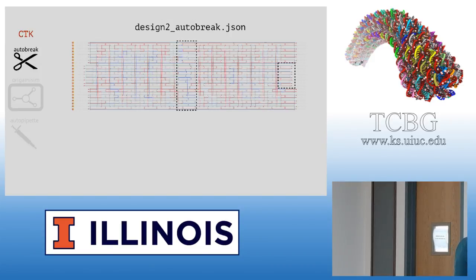But then, what you can do is, you have the DG parameter, and you want to specify also the length. Okay. So I want everything to be around 45. What it does is essentially a Gaussian, a probability distribution centered around 45, and it will try to optimize that. So let's say you have something else here. I want to make sure that everything has a 14 base stretch, right? I forgot about that one.